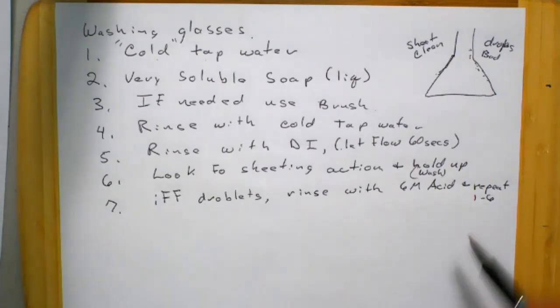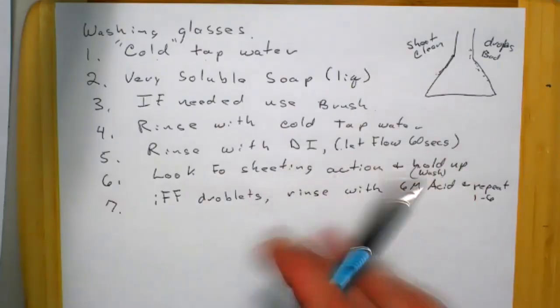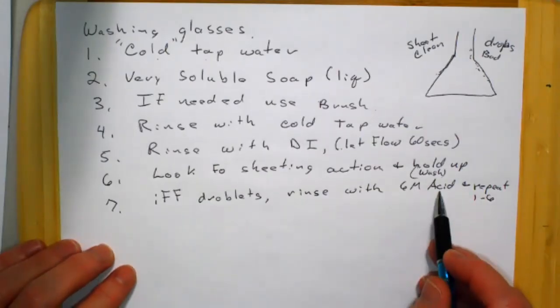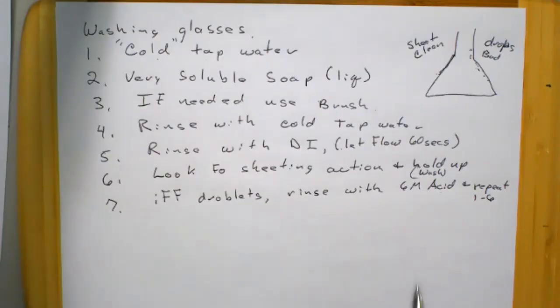So they're working really hard to be ready for us. And hopefully they'll have some 6 molar hydrochloric or nitric wash. That acid will pour into the flask, let it swirl around, let it sit a few minutes, and then pour it back in the wash container. The wash acid's going to be a little bit dirty, but it's okay because we re-clean.